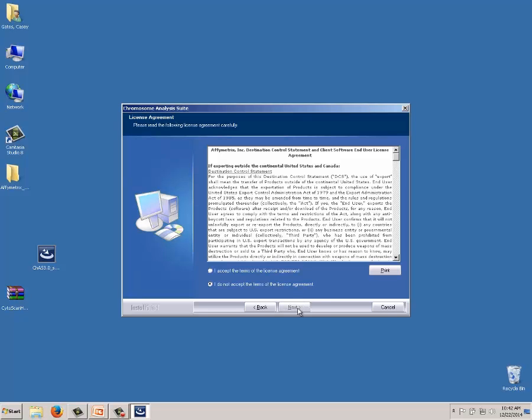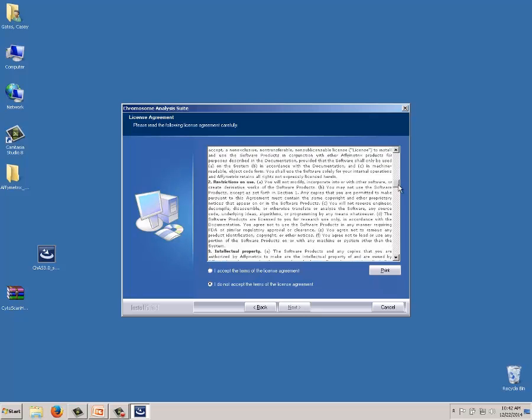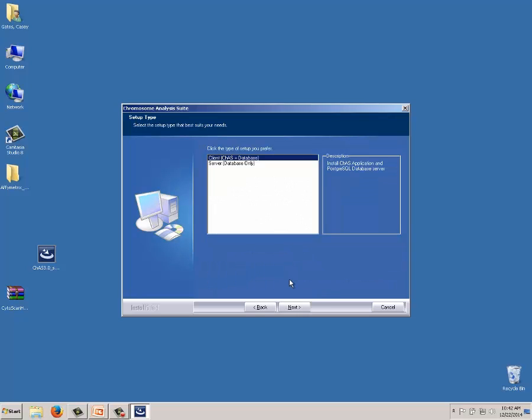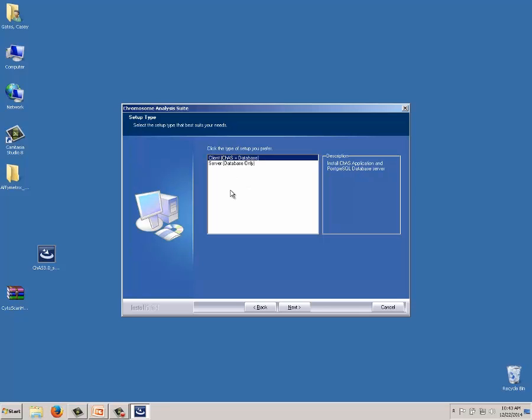The license agreement comes up — read through it, accept the terms, and click Next. Now we get two setup options. I'll select Client, which installs both the CHAS browser and the CHAS database on my laptop. There is also an option to install only the database on a server, for cases where multiple users already have the browser on their laptops. Today I'm doing both the browser and the database, so I highlight that and click Next.